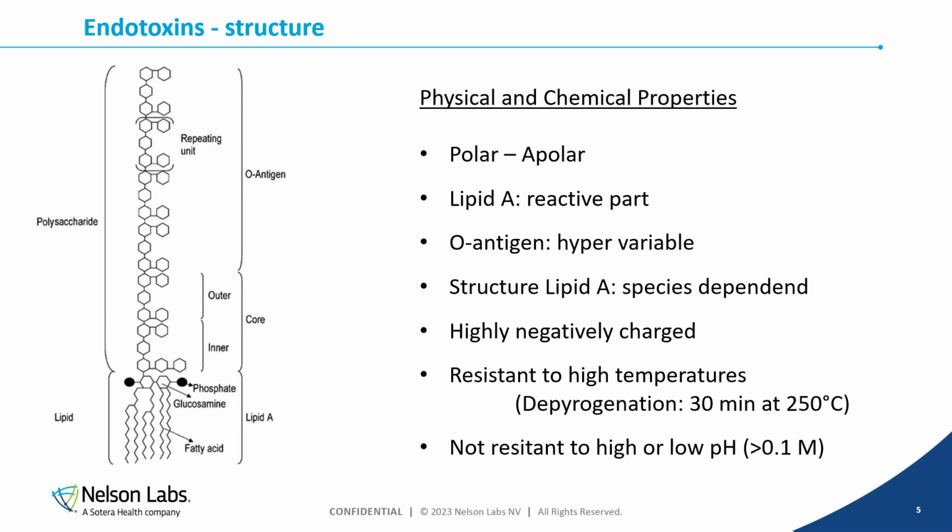And one of the first studies that I did when I started working at the company 20 years ago was we tried to inject or test filters for endotoxins.